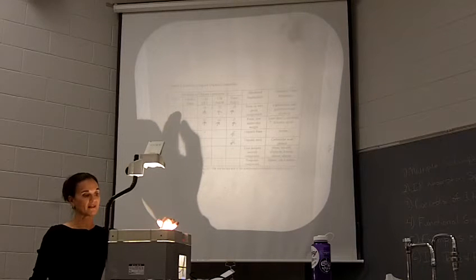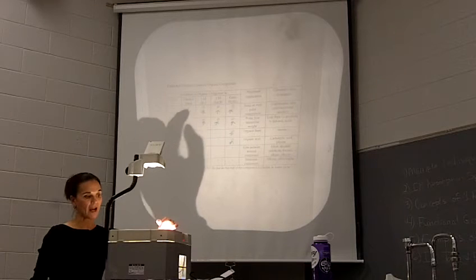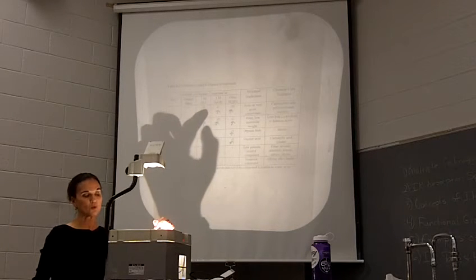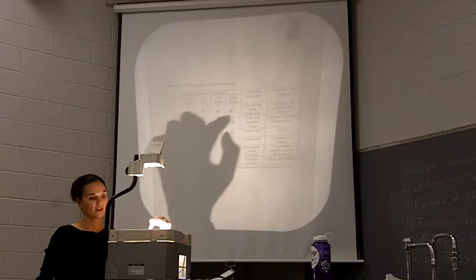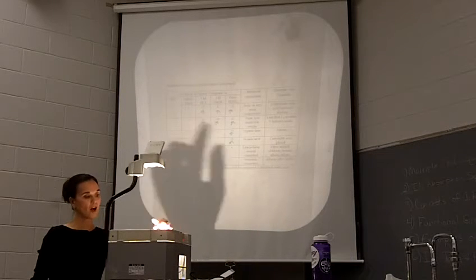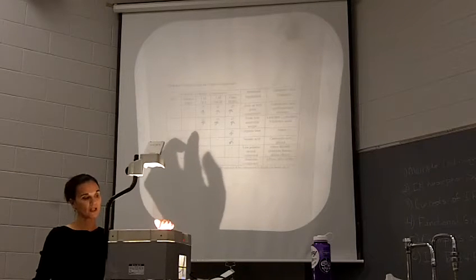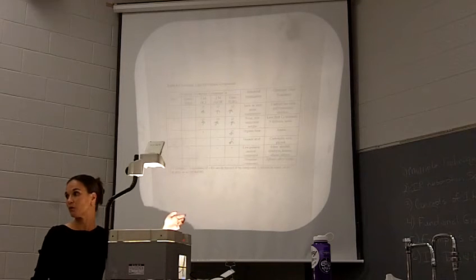If you have an unknown that is soluble in water, but not soluble in ether, then with that solubility pattern, you wouldn't go on to test the 1 molar HCl, the 2 molar NaOH, or the concentrated sulfuric acid, because the table tells you not to do those tests, okay? So make sure you follow the table in the order that it is given, and if you get a pattern where there are some solvents you don't test, then don't test those solvents, okay?